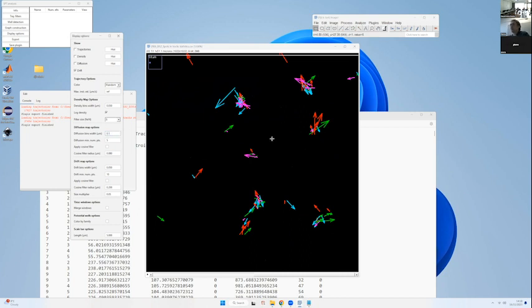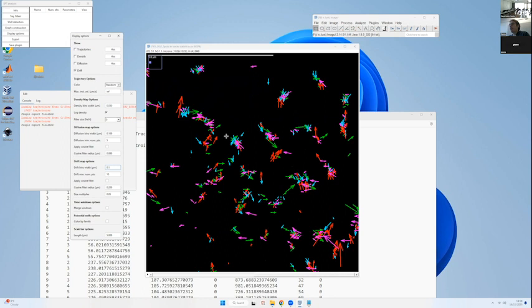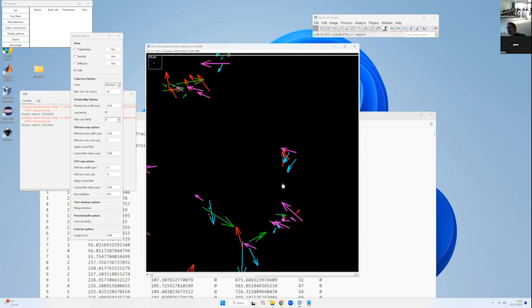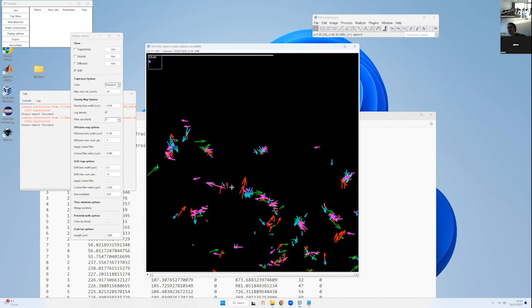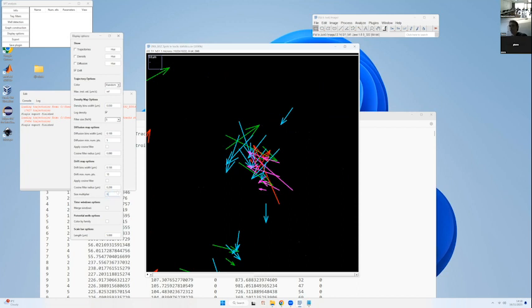Okay, I think it's good. So yeah, if we can find an example of a region with converging arrows. In this region, it's not the best region in the world, right? But you can kind of see that you have arrows converging into points.